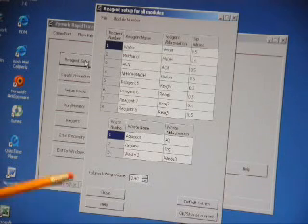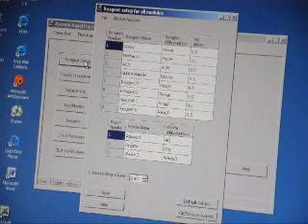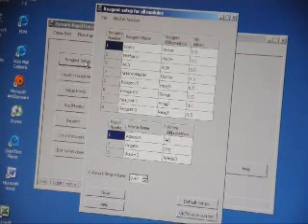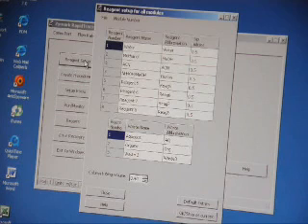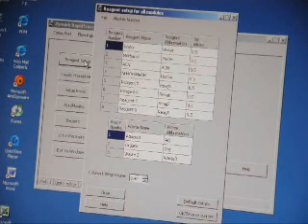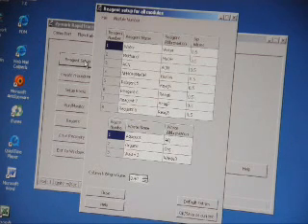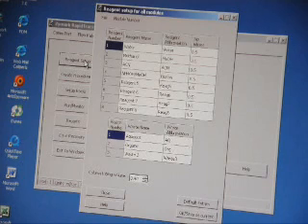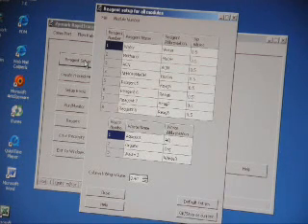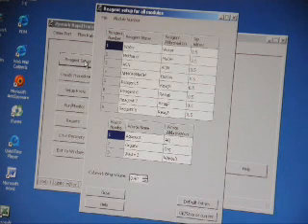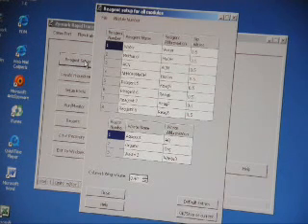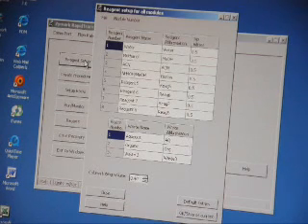We also have our waste at the bottom. And the Rapid Trace has three separate waste ports. And the reason this was done is it allows you to segregate the waste. If you're working with a biological sample such as plasma, you want to make sure that that waste is not mixed with your organic waste so precipitation could occur of the proteins in the plasma. So typically, you'll have an aqueous biological waste and then you'll segregate your organic waste out as well.